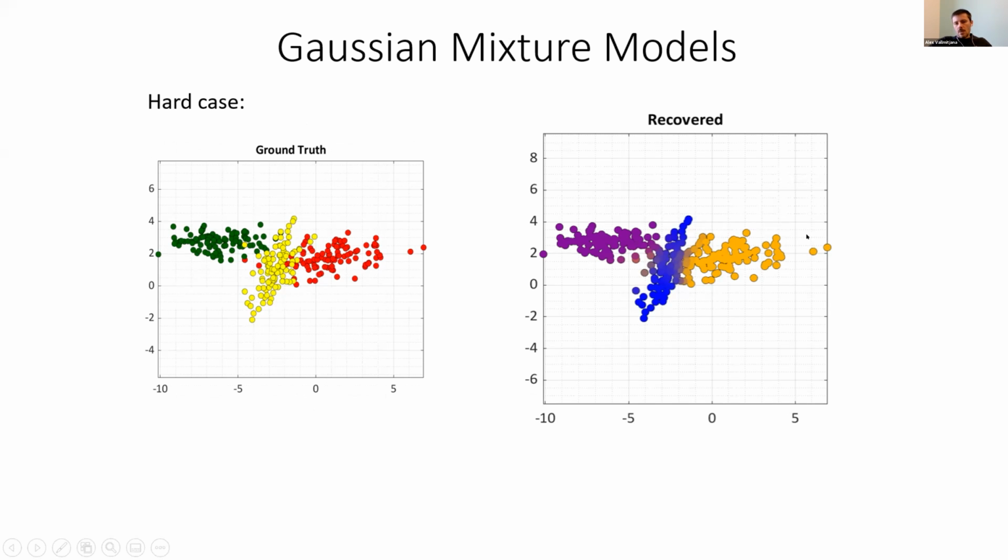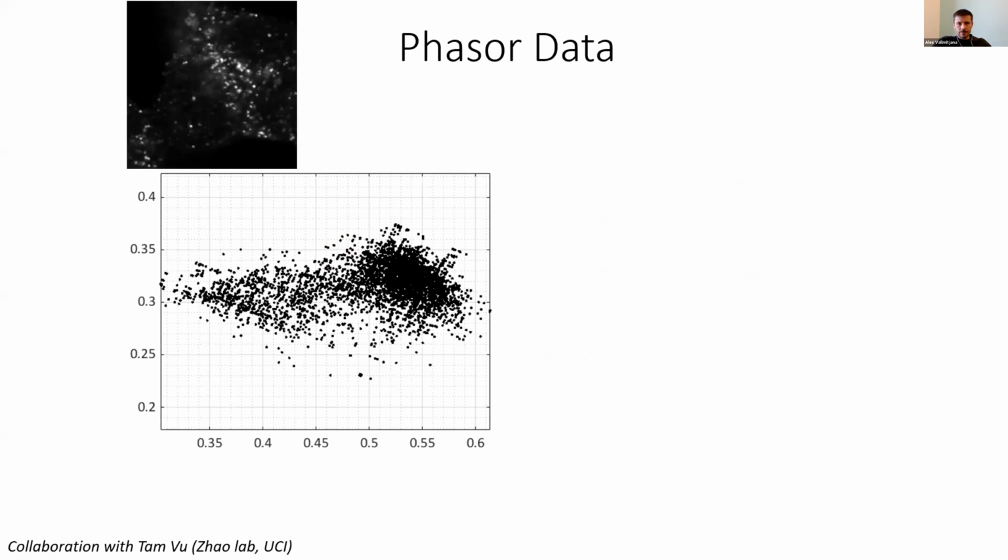So clearly the 2 points on the far right have 100% probability of belonging to the yellow cluster and 0 to the other two. But for some of the points in the regions in between, you get some proportion of values, which allows you to threshold them out if you want to be very strict with your data, or at least you have the knowledge that you are in a bit of an unknown or dodgy space.